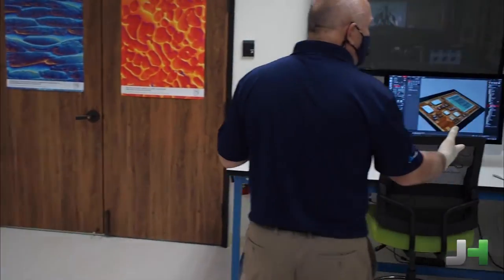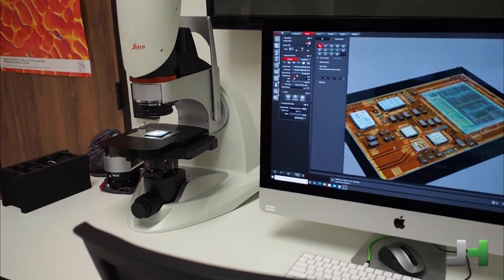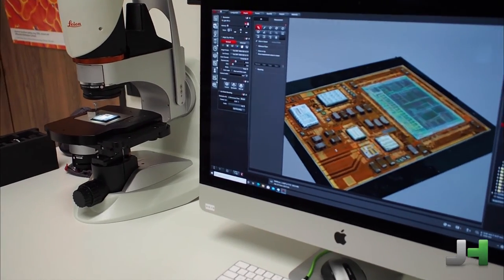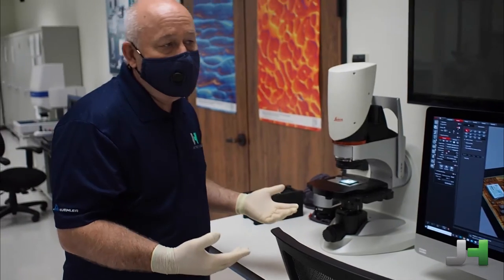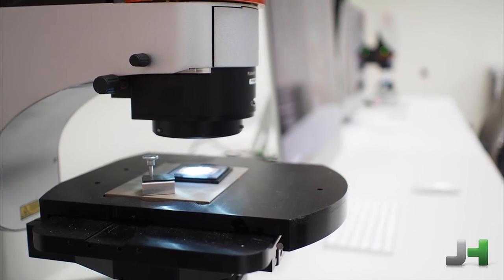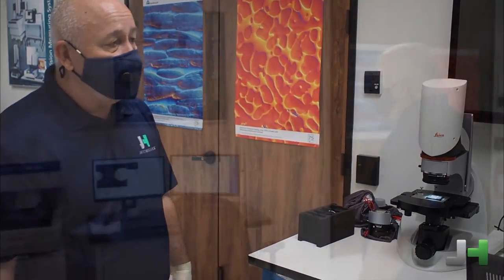Over here, we have the Leica digital microscopes. These microscopes are microscopes that don't have eyepieces, but can generate incredible three-dimensional images along with three-dimensional views of optically visible products.